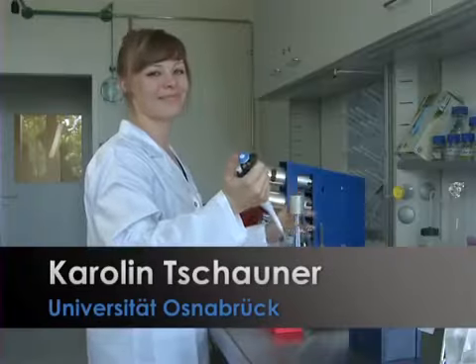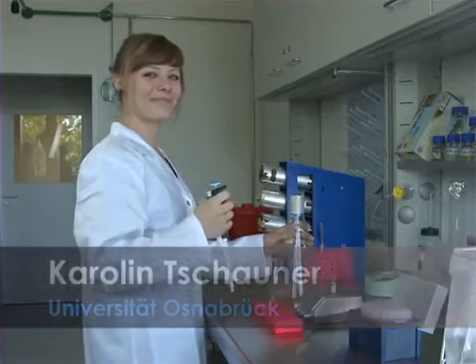I'm Sabine Hunke, and we will show you today the membrane SPINE technology. The main advantage of this technology over existing methods like co-IP is that it allows you even to detect low affinity or transient protein-protein interactions. Karolin Tschauner will demonstrate the procedure. She's one of my PhD students who developed the protocol.